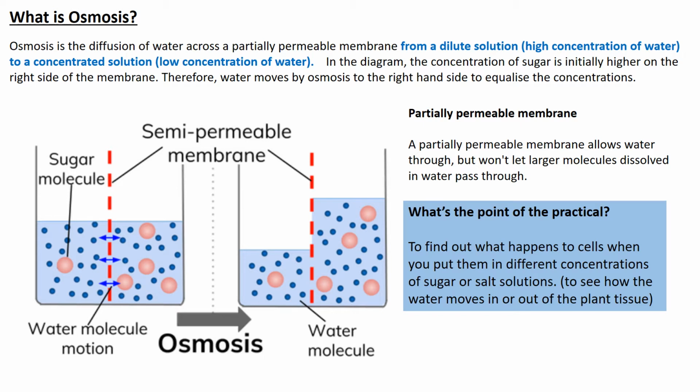So the point of this practical, which I have often wondered, however, people have been doing it for years and they love it, and the exam board love it. So therefore, we are looking at the different effect of salt or sugar, not at the same time, guys. Salt or sugar, can be talking about either. How the water moves in and out of plant tissues.